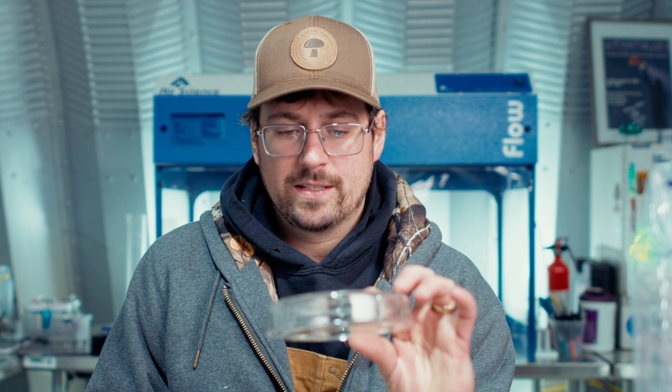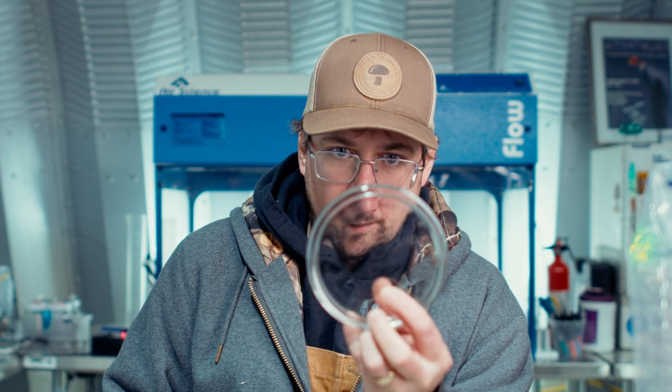Some cons of using the glass dish: it's bulky, so you're not going to be able to fit as many in your incubator at once. However, it does allow for more growth on the surface area, so the larger size is kind of a pro and a con. The other major con is that glass dishes need to be cleaned. I recommend having a few on hand if you plan to use them often, otherwise it's going to take time to clean them up and keep your inventory fresh for your projects.